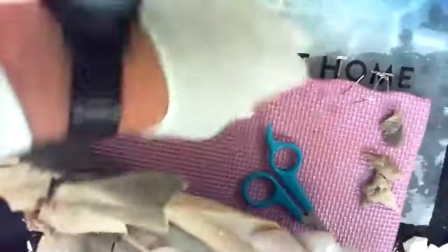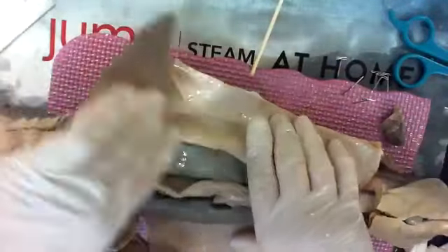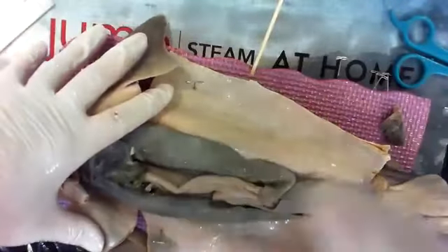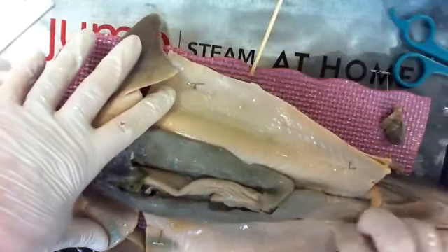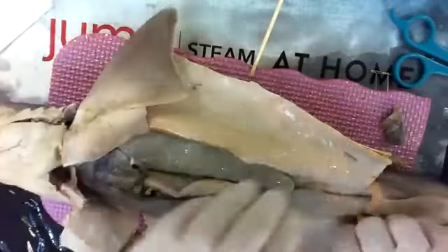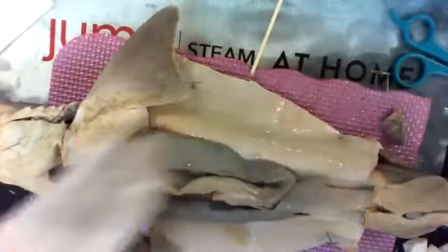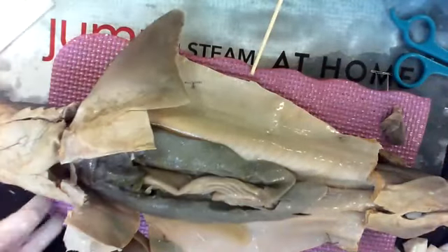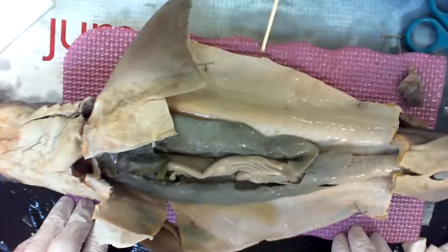And I will pin it open like this. Take a pin, stick it there. Take a pin, stick here. Take this pin, stick here. Oh, that one keeps popping out. Well, if it keeps popping out, I'll just grab another place. Better. Boom. Open it up.